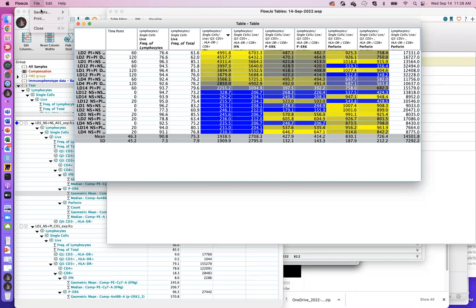And then of course you can save this. So you can say file, save as, text CSV is probably the best option. You can also save as Excel. I recommend that even if you're using Excel, save it as a CSV. Excel can read CSV files just fine. So I would save it this way. That way you don't run into any strange symbols and having problems with your pipelines downstream. So save it as a CSV to avoid any headaches in Excel.